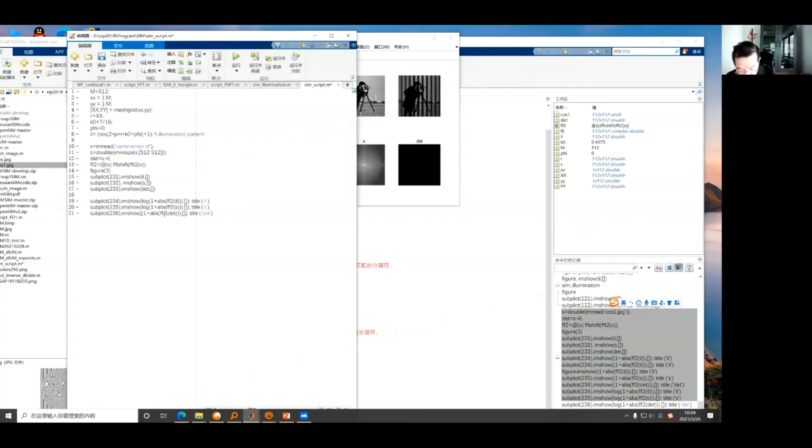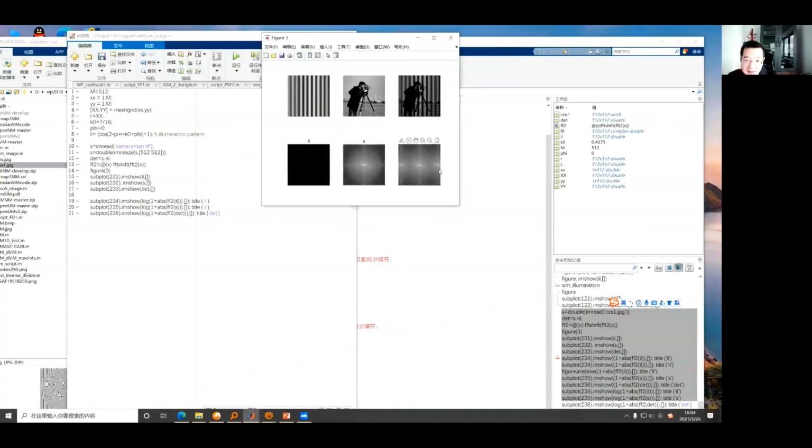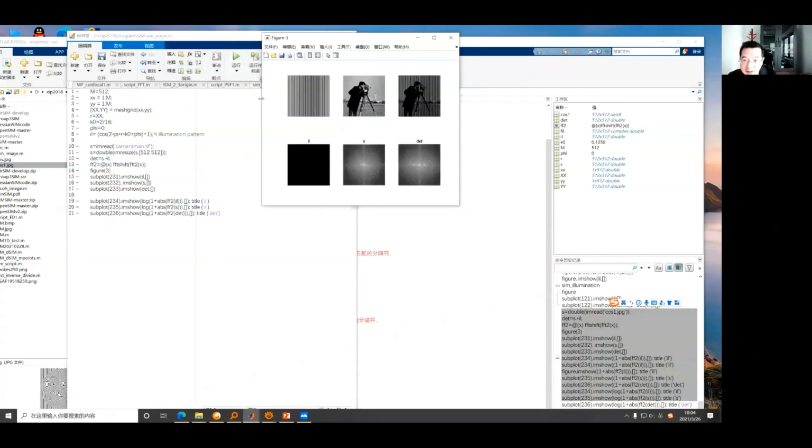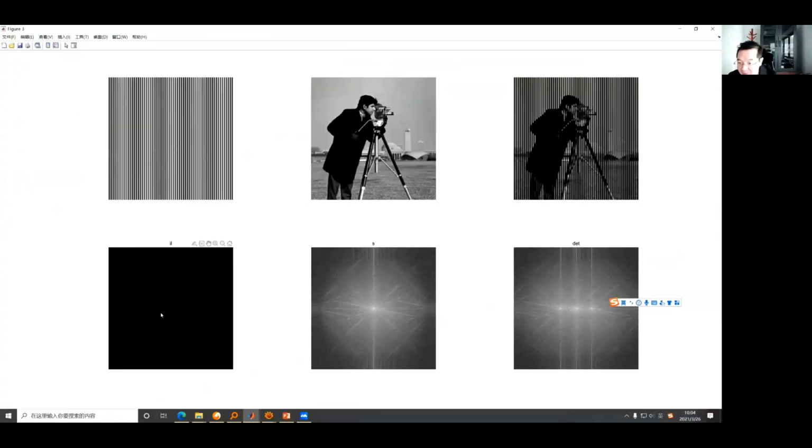Oh, here once again, because I forgot to log, the pop-up doesn't give me the correct result. As you can see here, if my component is shifted here, it will generate 3 copies here.